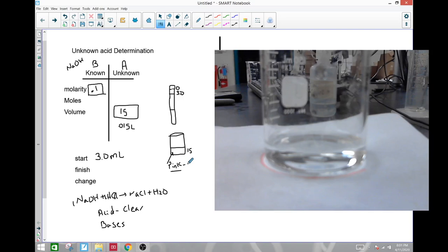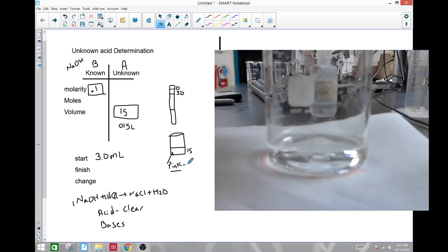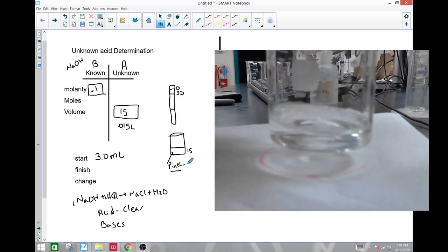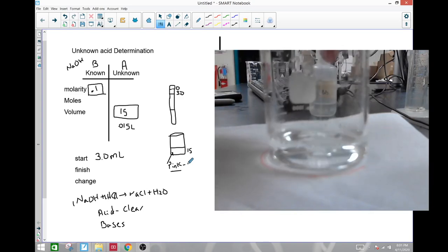All right, so that would tell me that I'm going to be at equivalent. So let's start dropping this in here. Hopefully you got a decent view of this. And as I drop it in, it takes a little bit of time, and you can stir.